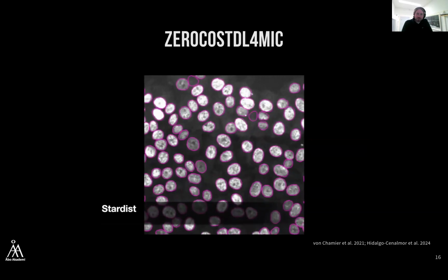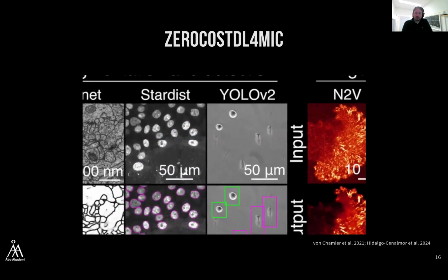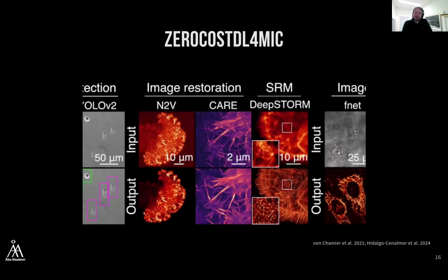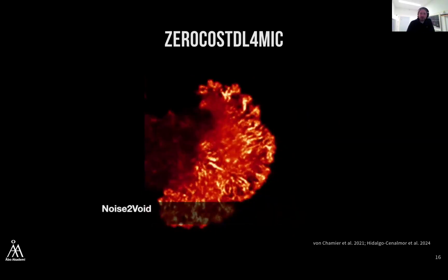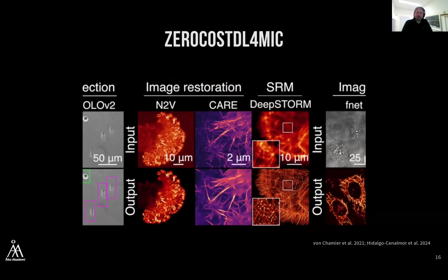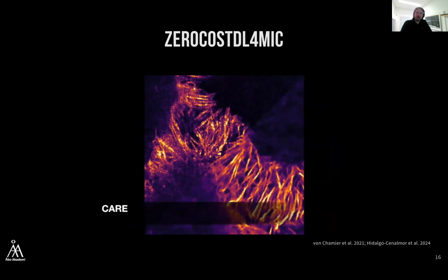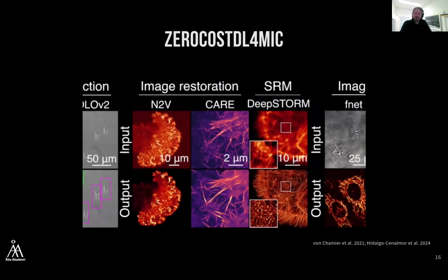automated cell tracking, which has proven to be very helpful for our own biological question. If you want to identify cellular states, denoising can also be very useful if you do live imaging, because using denoising tools will allow you to reduce laser power and might mitigate phototoxicity. Something that we've been using quite a lot for live imaging, structured illumination microscopy, is to use things like CARE, which allow us to restore very noisy SIM data.